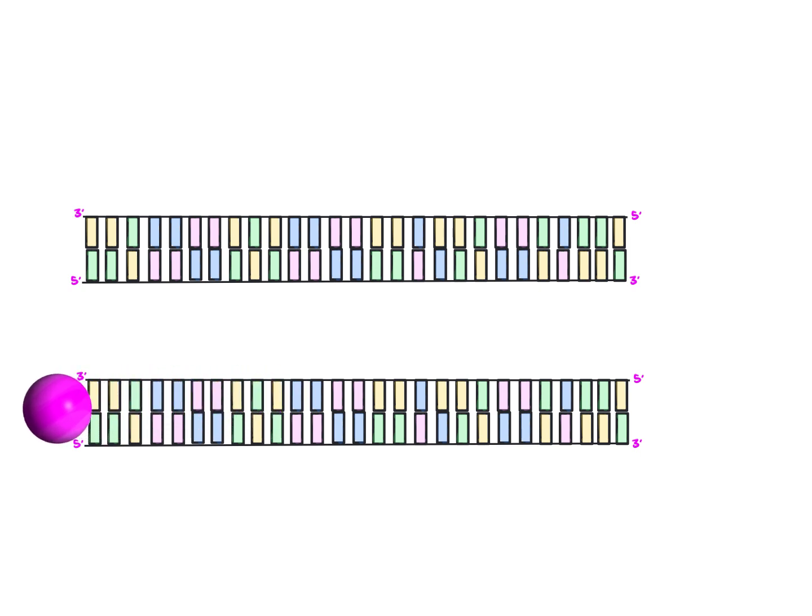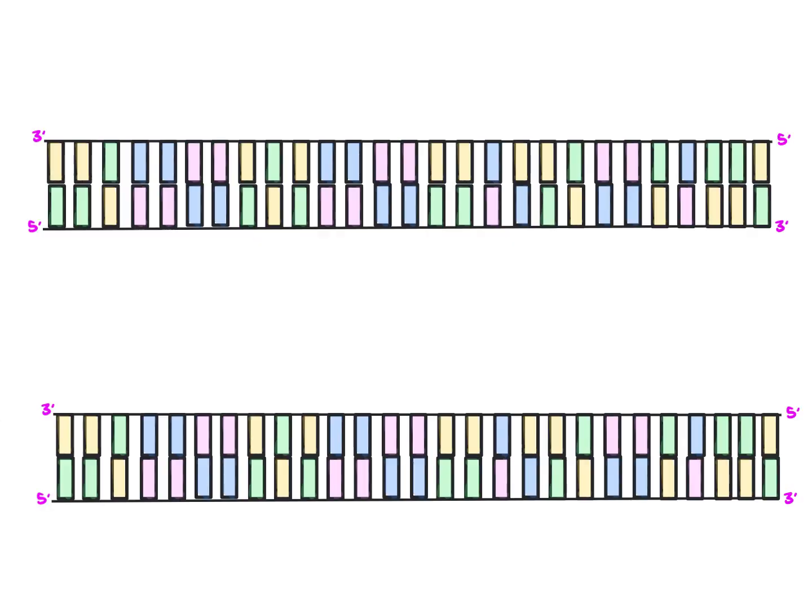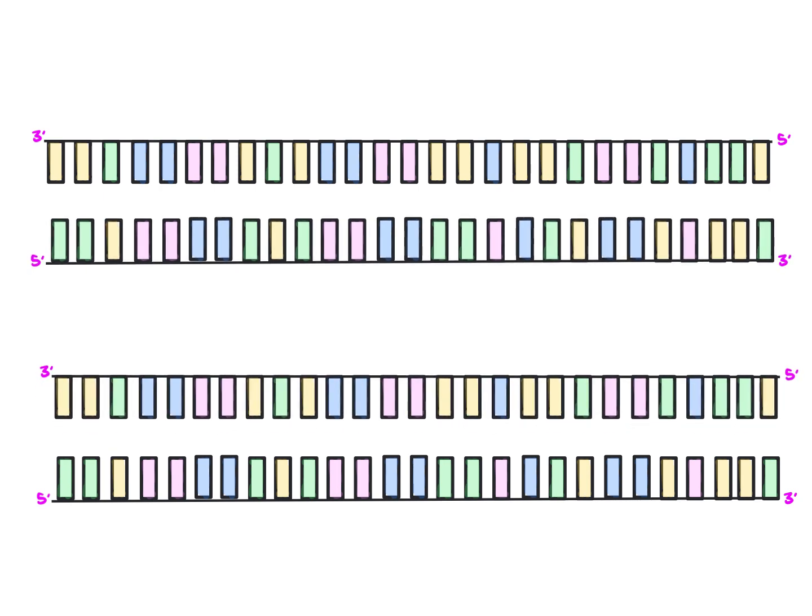So we've got two strands of DNA replicated there. And we have two DNA sections. We're going to increase the temperature again, and we're going to separate those two sections of DNA. Pop those up there. So what's in our PCR mix?